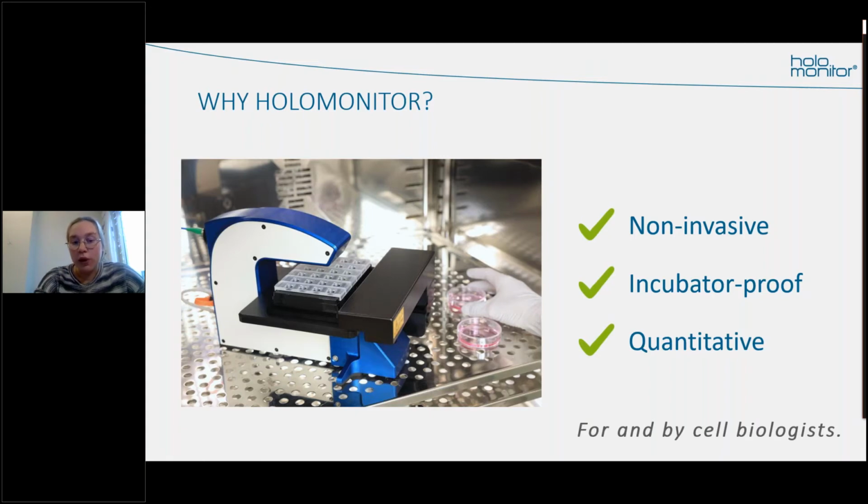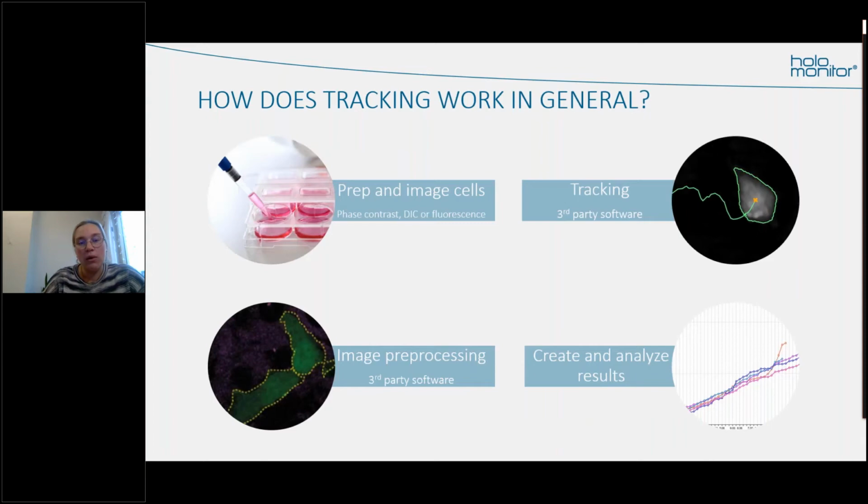Now that we covered why you should consider using single cell tracking and the technology behind HoloMonitor, we will continue with how single cell tracking actually works. I will start by going through the general workflow and then compare it to how single cell tracking works in the HoloMonitor.